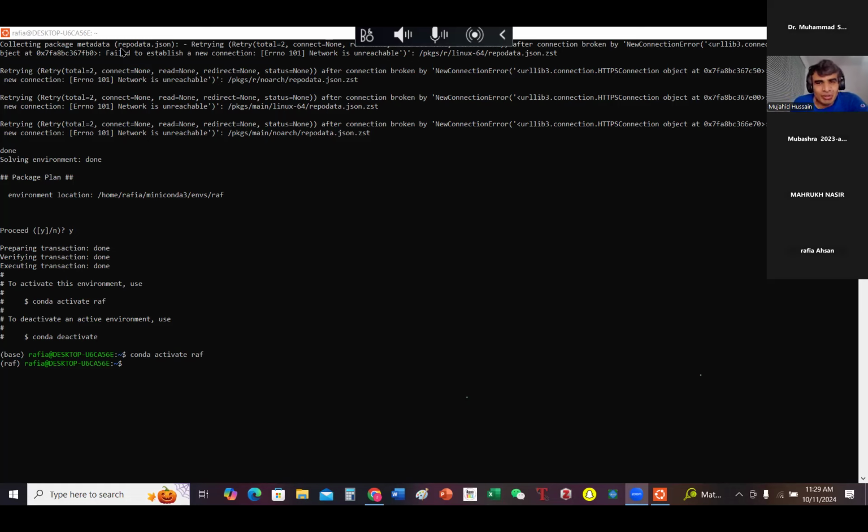As you know, we need to install different packages in our Linux environment. For installation of different packages, we need an environment. So how did we create the environment? We installed Miniconda. Using Miniconda, we have created an environment. Now we can install our desired software. So what type of software do we need? I'm going to show a pipeline. After showing you the pipeline, we're going to install all required packages, and then we can go forward to our analysis tomorrow.